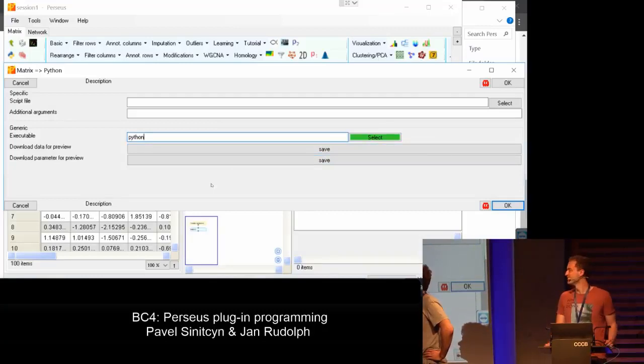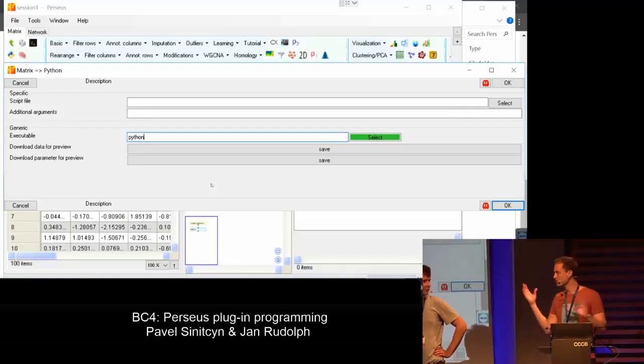You okay. I have many questions. So you can try your things. But this was just, I wanted to start from how it looks in the GUI, and I think now we will get our hands dirty. Yeah, but can I ask?